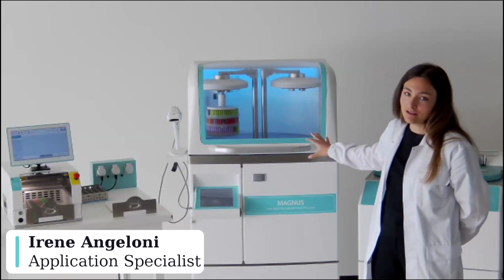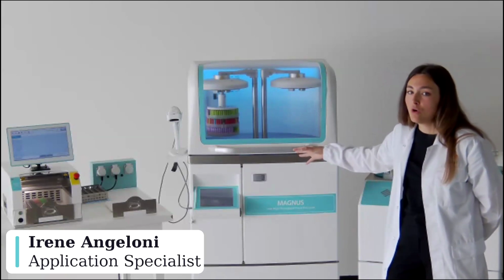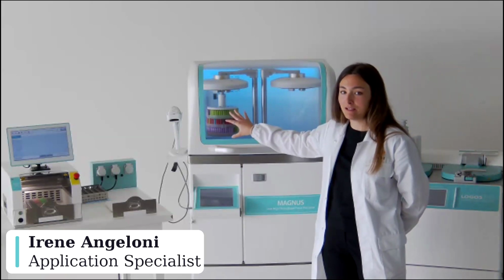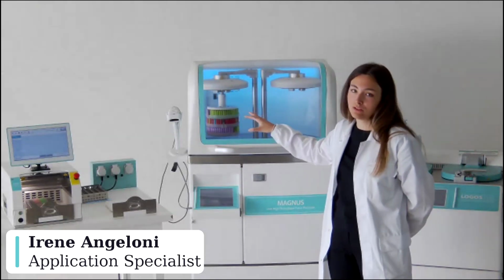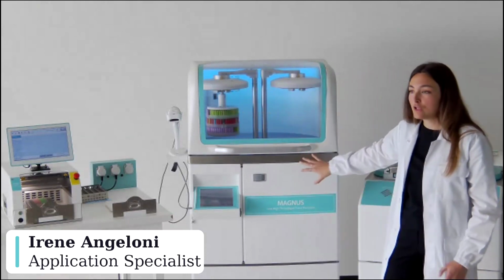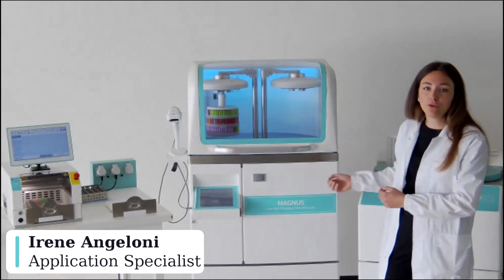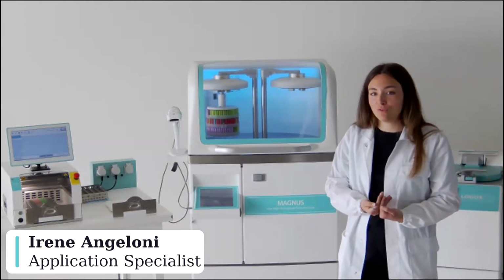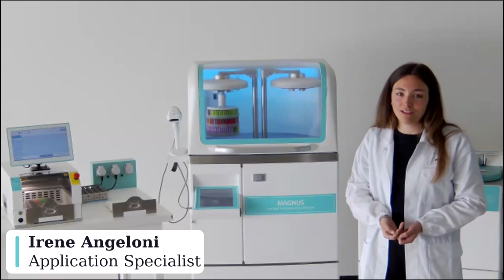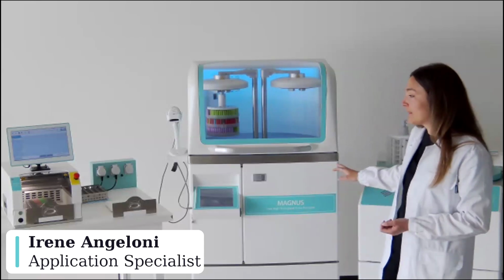So in particular, in the case of Magnus, the rack, once it has finished all the steps in the main cavity, thanks to the robotic arms, automatically moves into the wax cavity. So wax is not moved, and for this reason, since we don't move the wax, we also don't have to clean the cavity at the end of the run, because wax remains in that cavity.